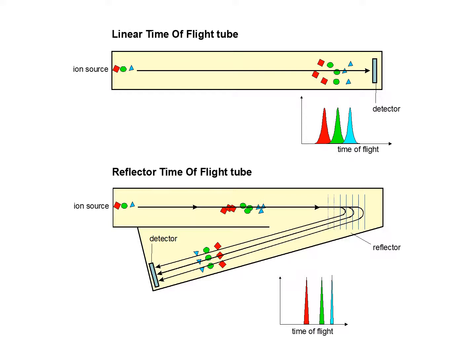Here's just one type, and then notice the wide peaks, and you're saying, well, why doesn't everybody use this, right? Look at the narrow ones, not a lot of cross contamination. See right there, that's two proteins crossing, very clear. This probably costs a lot more. So the poor man's MALDI-TOF and the rich folks' one right there. So when you have this in your house, this is probably a better investment for your MALDI-TOF for next Christmas.